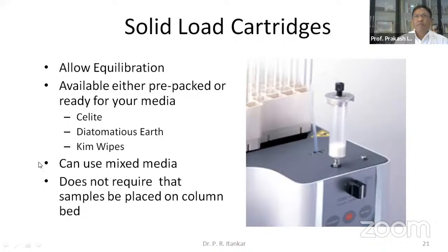Many times the question comes up when you have a sticky compound and how to load that, because it is neither liquid nor solid, and such a sticky sample is difficult to load in this kind of system. So what is desired here is to prepare that sample by loading it on activated silica.